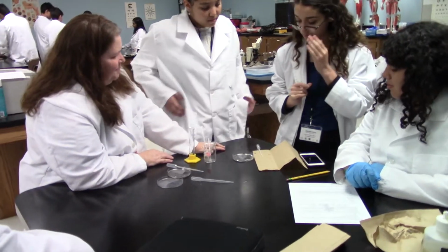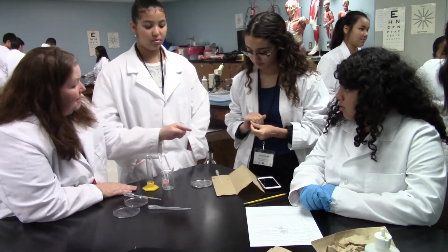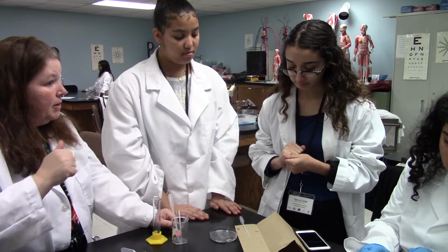He's dying. Timing piece. And then what's going to happen at the end of 30 seconds, you're going to suck him back up, get him back in the tube. He ain't going to like it. And then again, focus in and count to see what happened, if he's still at 15 or if he went up or if he went down.